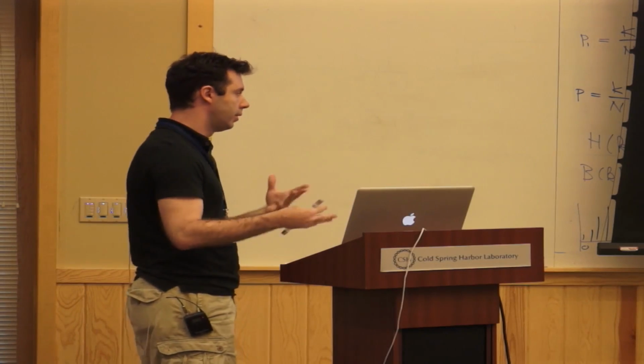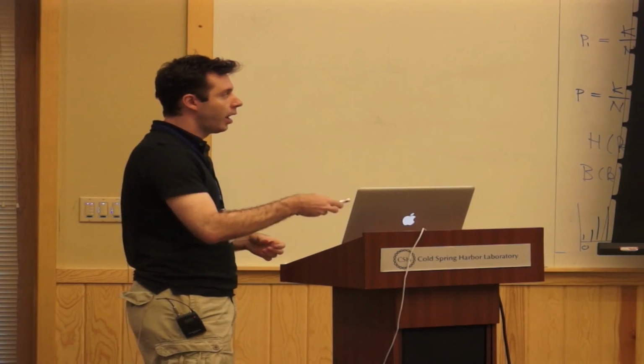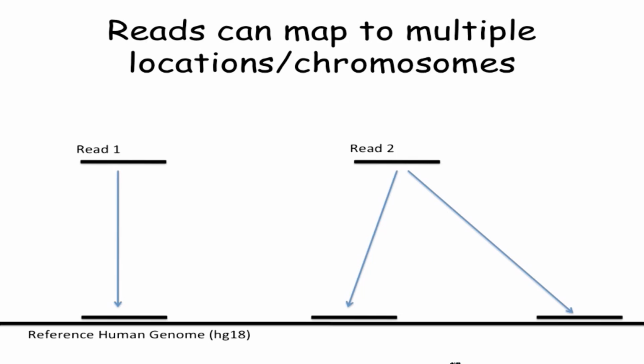So the ability of these aligners to detect mutations or variations is not as important. That being said, typically your reads are coming from cells that have a genome that's different from the reference genome you're using for mapping. And if your aligner is good at allowing mismatches, just polymorphisms that exist between genomes, then you might be able to get more reads as a consequence of using a better aligner.